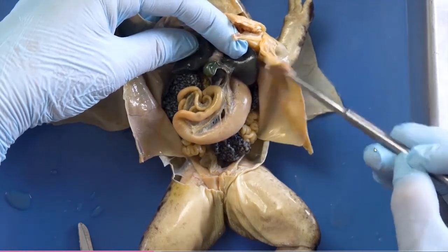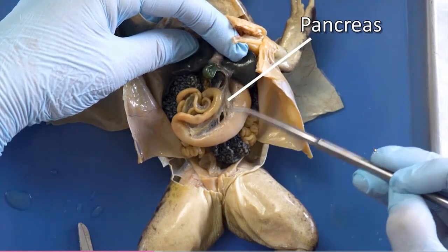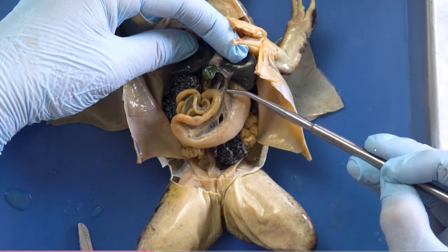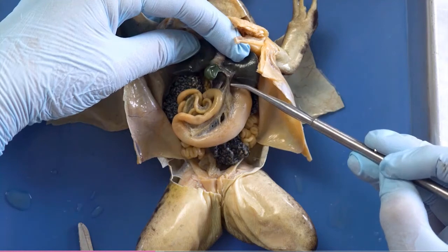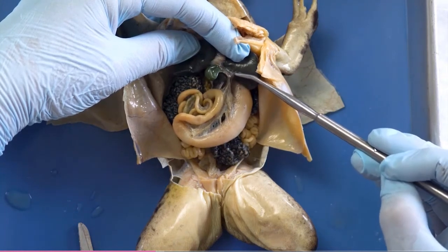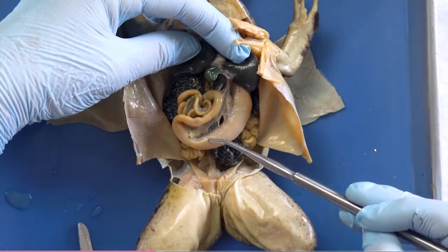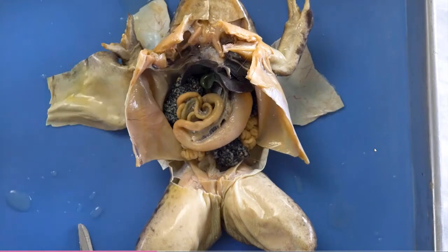Also right here, and it's in plain view, and this can be sometimes tough to find, is the pancreas. Looks a little bit like chewed up juicy fruit gum, and it is also leading in right here. These will be important to retain as you're looking at your model. I'm going to remove the liver now so that we can take a better and closer look at this digestive system. So I will just remove these 3 lobes of the liver.